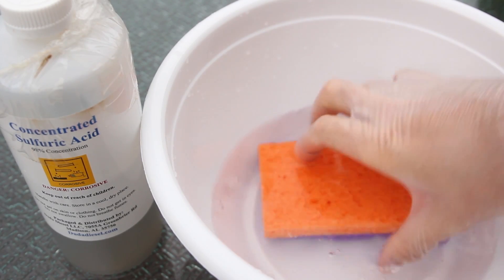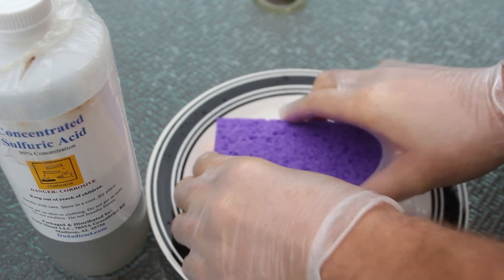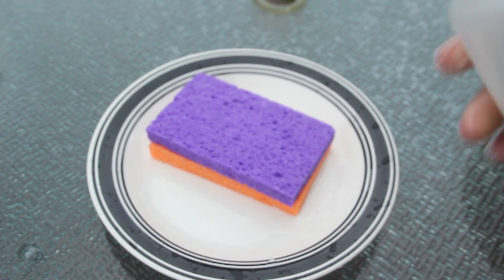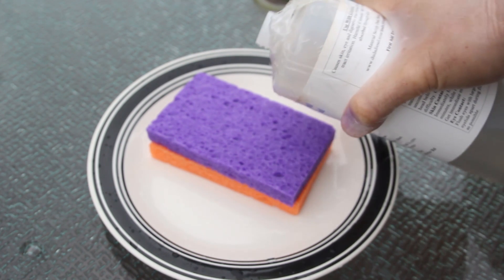We're gonna dip the sponges in water, then set them on a plate so it's protected and it's not gonna spill anywhere, and we're gonna pour acid on the sponges and see what happens. This is really dangerous, so I'm doing it outside. I do not recommend trying this to anyone else. And I'm just gonna pour it on top of it.